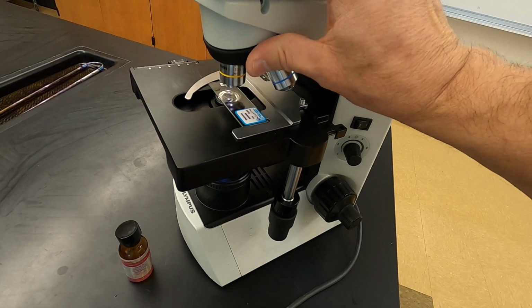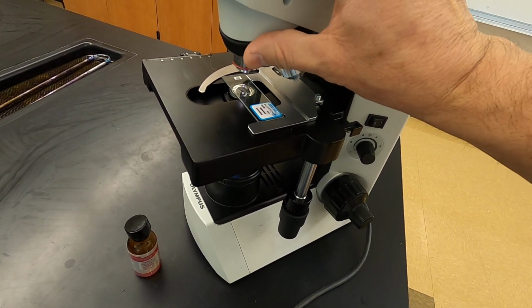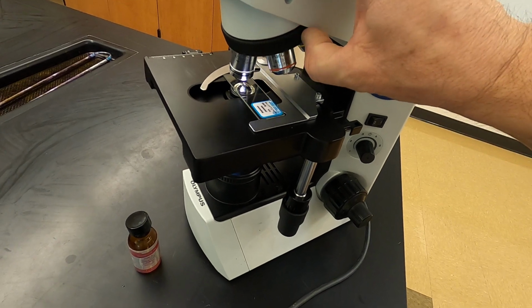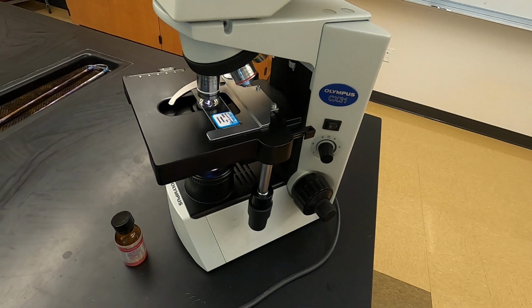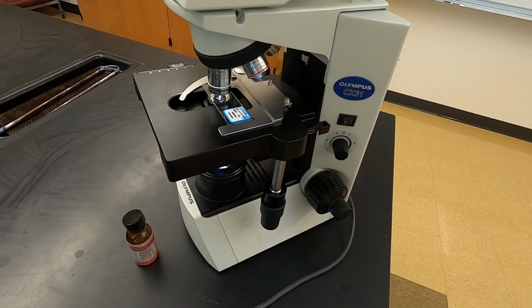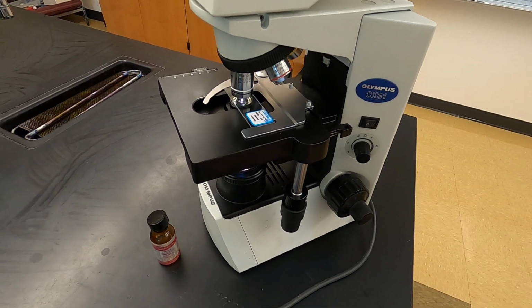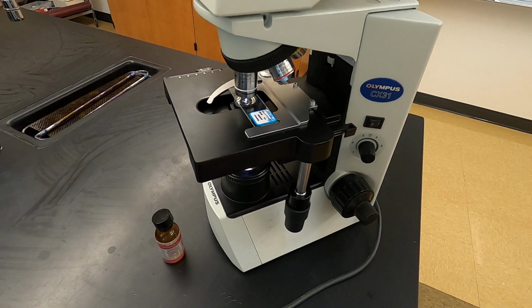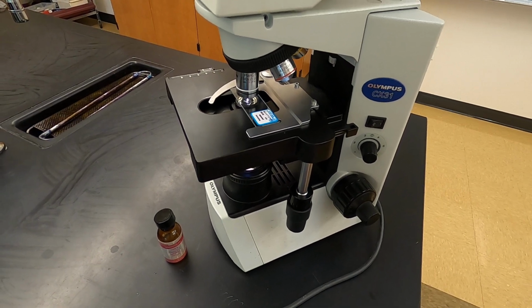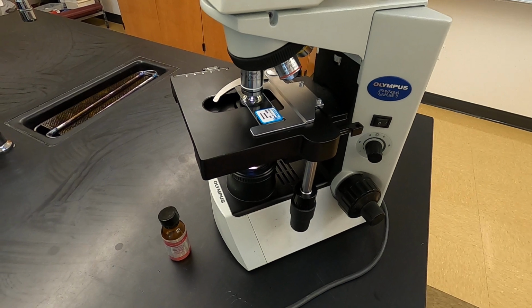So once I get it refocused again, we go back to the scanning objective, and then back to oil immersion and adjusting our fine focus. Hopefully we will be able to have our subject once again. So I will keep reminding you this the entire semester, to never ever, once you have oil on your slides, go back to the 40x objective. So that's something that both I and the tutors will be looking for to make sure that we keep these microscopes safe.